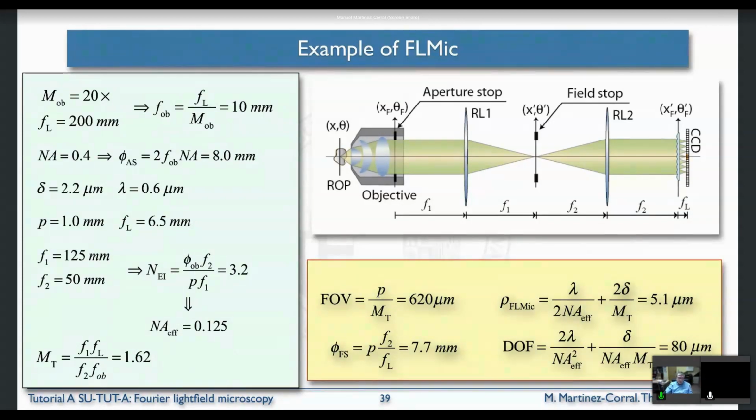This is the wavelength we assume, and we have taken one of the microlens arrays from our stock. This one. This is the one we are going to use, but there is a big flexibility here. So we put here a microlens array with pitch 1 millimeter. Sometimes we would call it not microlens but millilens. But we call it microlens array.